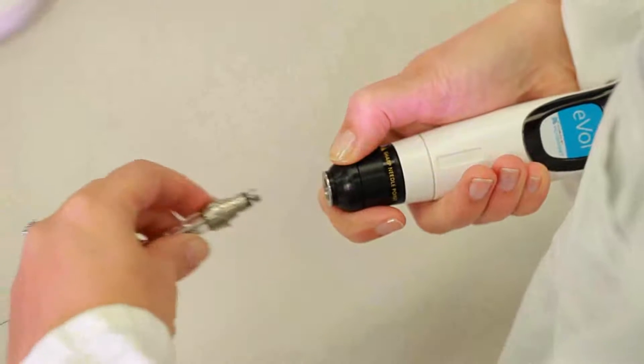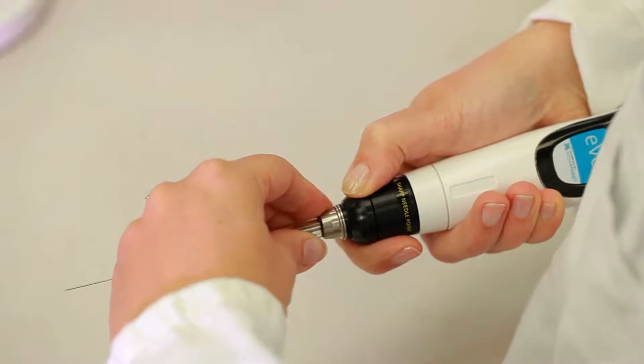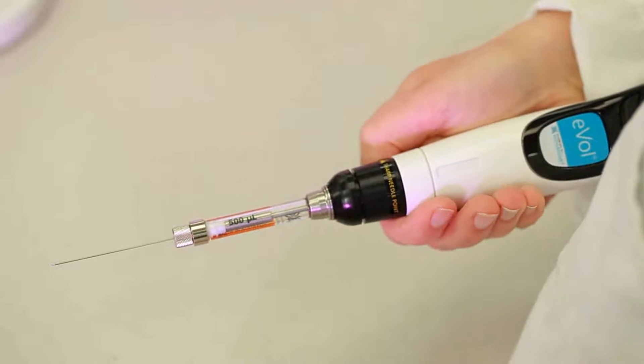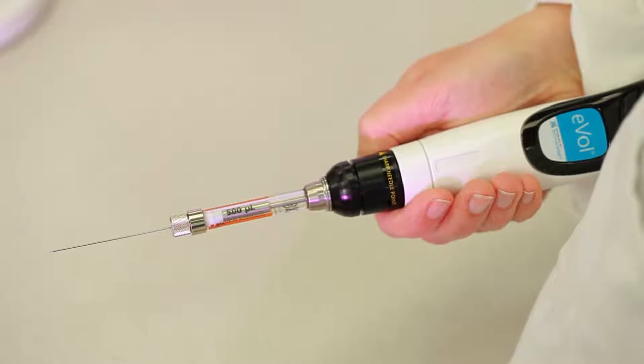The syringes can be easily and quickly changed, allowing them to be dedicated to individual liquids or methods, or to avoid cross-contamination.